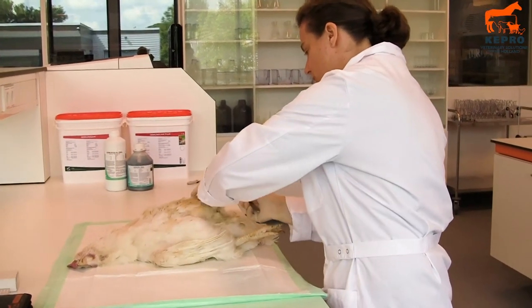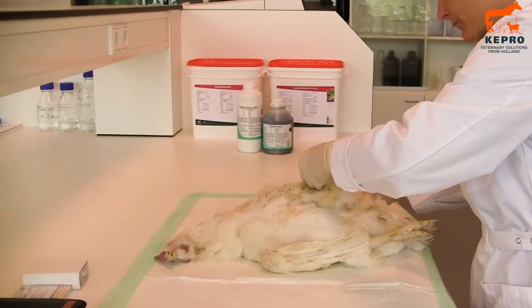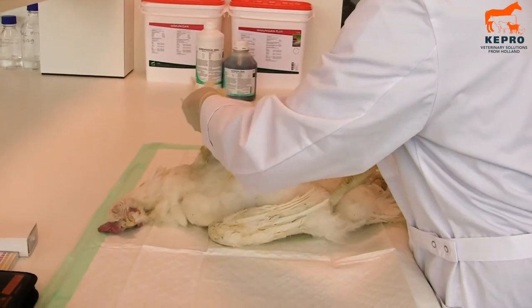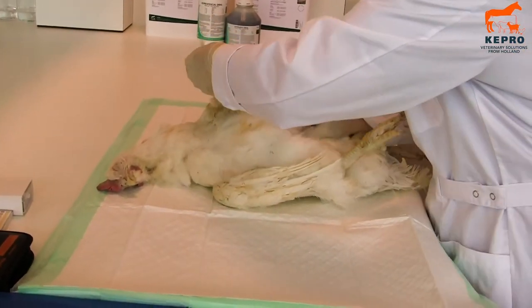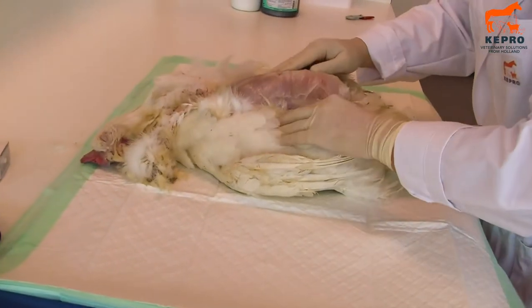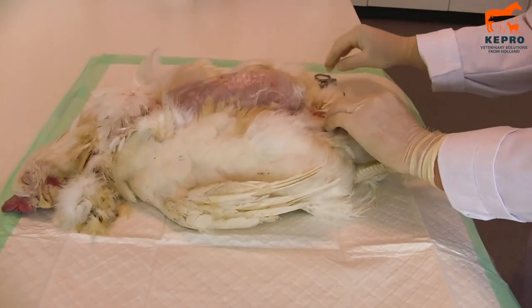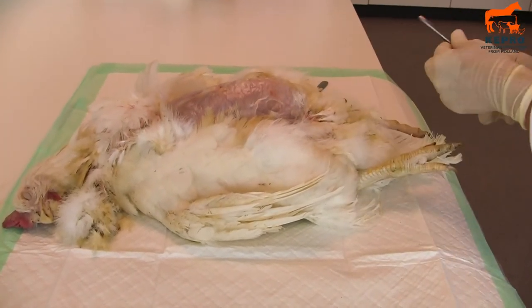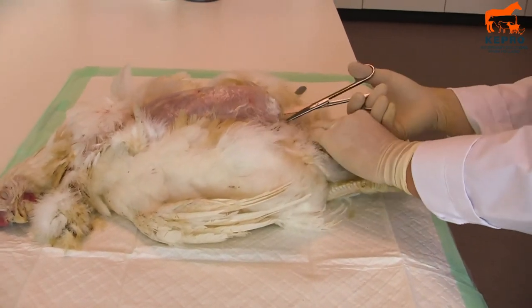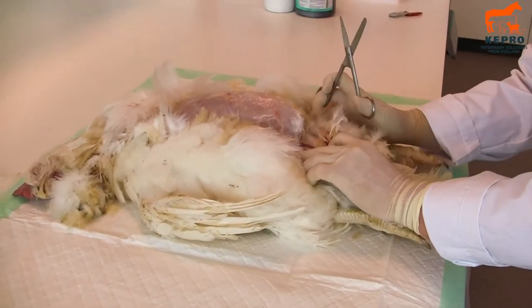What you do first is make a small incision here in the stomach and you pull the skin towards the head. Here you see the breast muscles which is the meat. Then we take a pair of scissors and start opening up here. Here you can already see the abdominal fat.